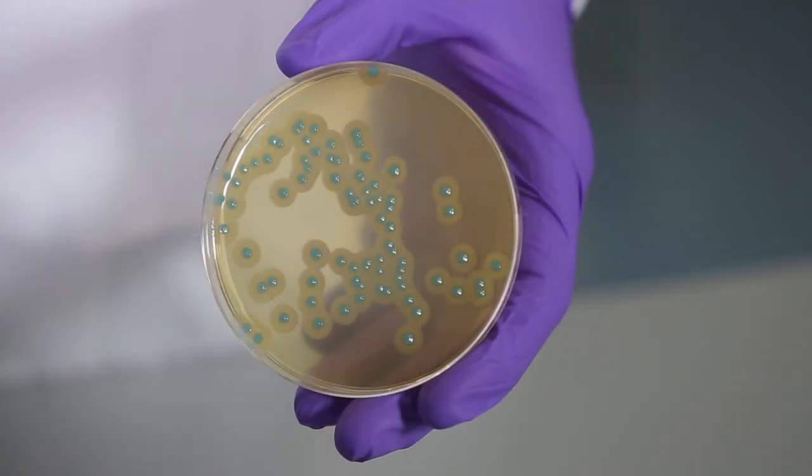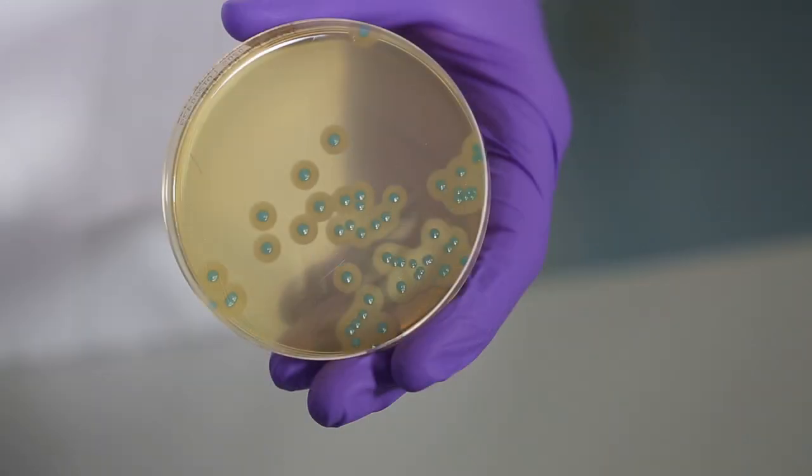You can see as we increase the drying time we start to see a reduction in size, colour intensity and halo production. We also start to see a drop in number.